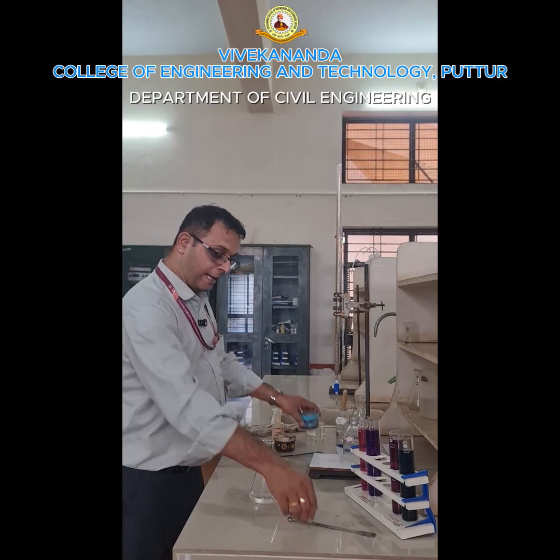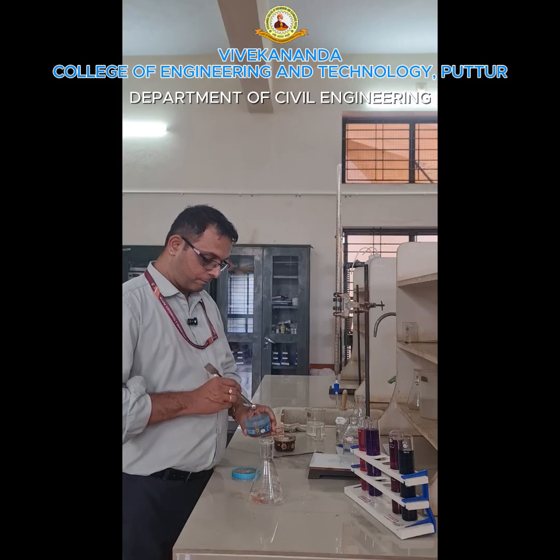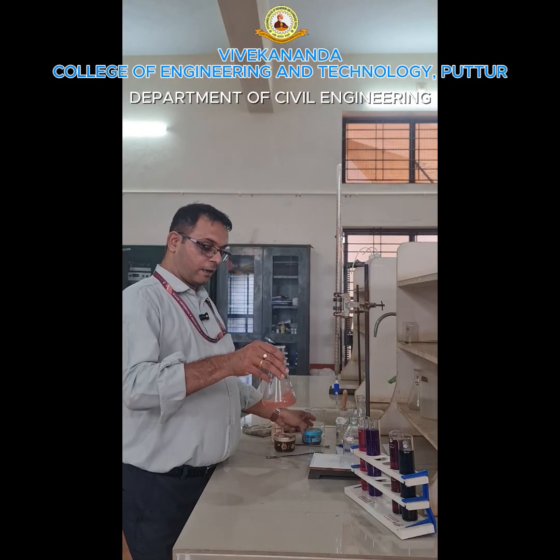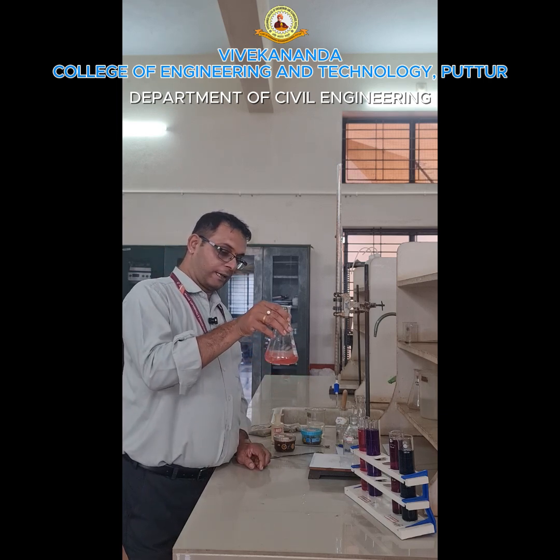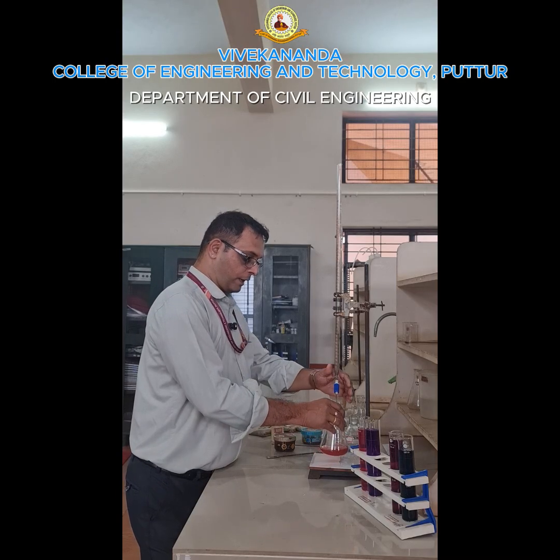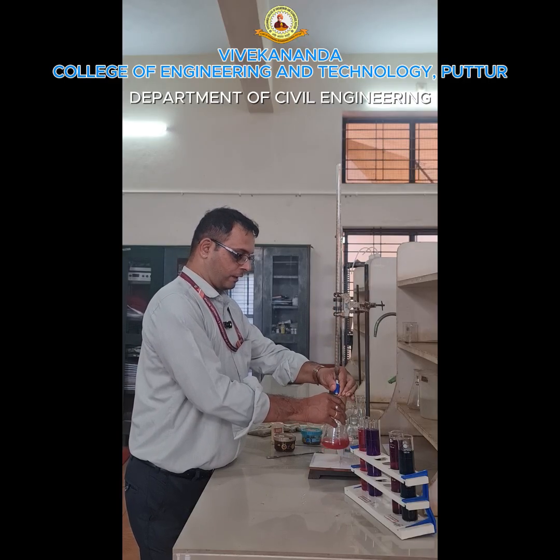Now I will use another indicator, that is called murexide, once again a salt. So a pinch I have to add. Murexide indicator I will add. Now you will get the wine red color, right? So once again, after getting the wine red color in the conical flask, I will note down the initial reading, then do the titration.